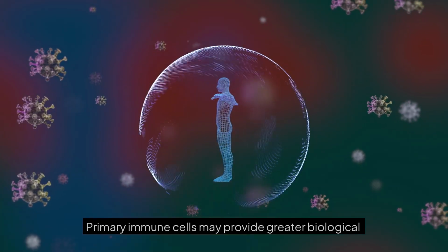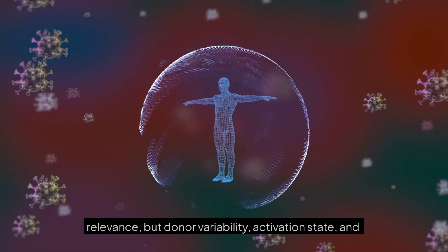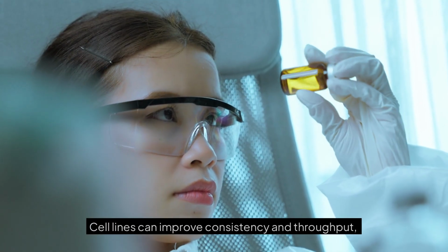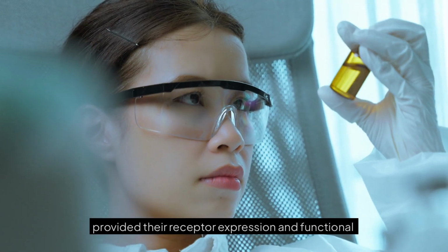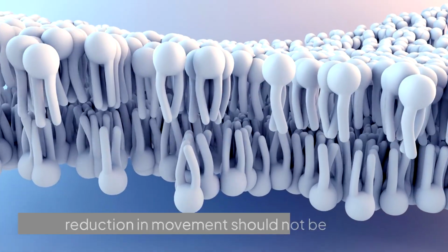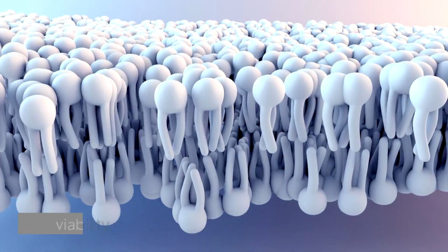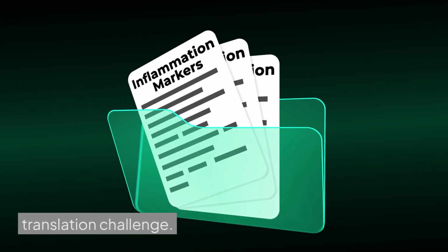Primary immune cells may provide greater biological relevance, but donor variability, activation state, and limited material can complicate execution. Cell lines can improve consistency and throughput, provided their receptor expression and functional response are verified. In either case, a concentration-dependent reduction in movement should not be described as selective chemotaxis inhibition when it tracks with reduced viability. Inflammation studies face a broader translation challenge.